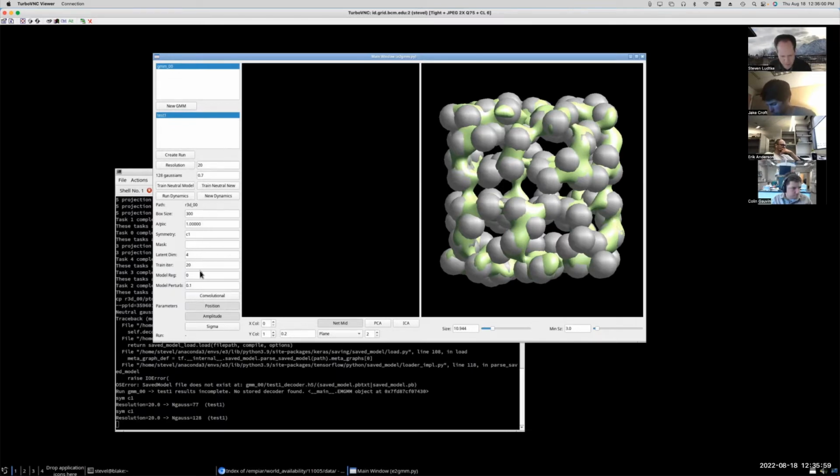So that's about it. The box size is preset. That's the size of the particles we generated. Angstrom per pixel is preset. If you impose symmetry here, it wouldn't work very well, because the things we're looking for are breaking the symmetry. So we don't want to have symmetry specified here. And then we talked about everything else.